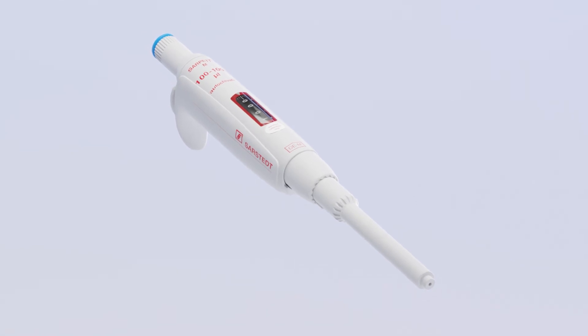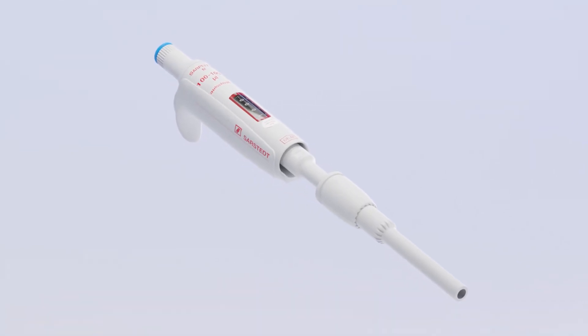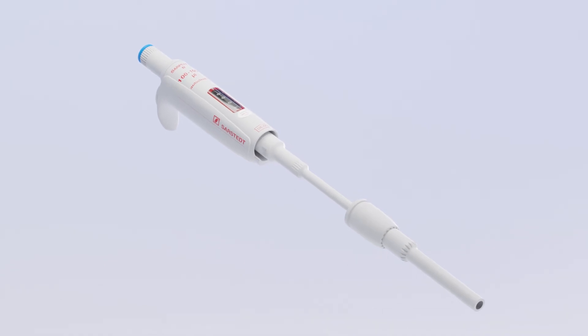The Sarpette M can be dismantled for quick and easy cleaning. This ensures secure, contamination-free pipetting in your laboratory.